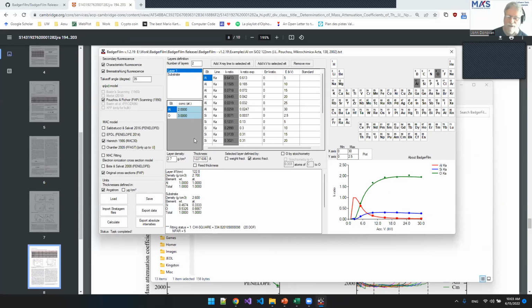Yeah, and of course that's the mass thickness, and then you need to know the density, which can be problematic. Sure. Yes, if you want the mass thickness, you can have these results here, so it's independent of the layer density. But usually you need to know what will be the layer density to have the results in nanometers or angstroms.